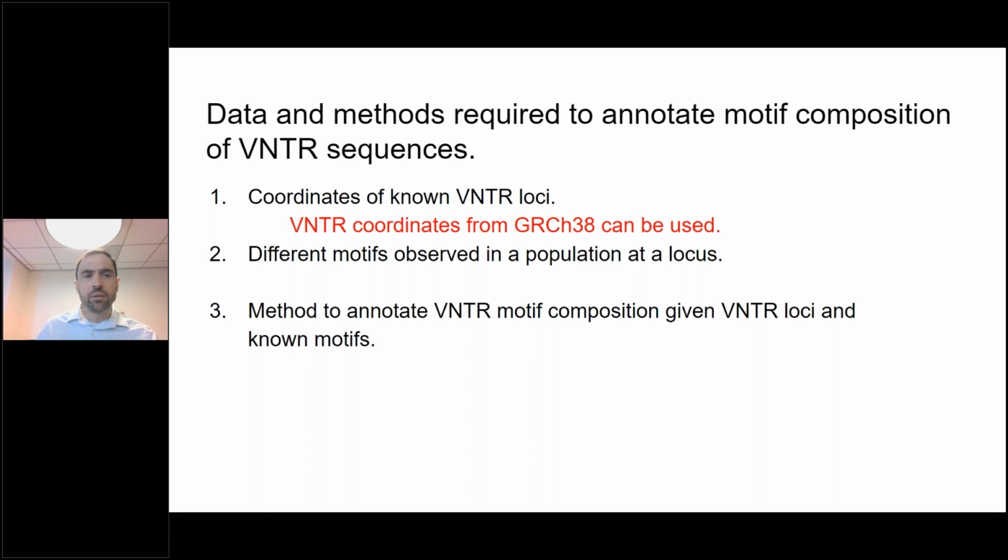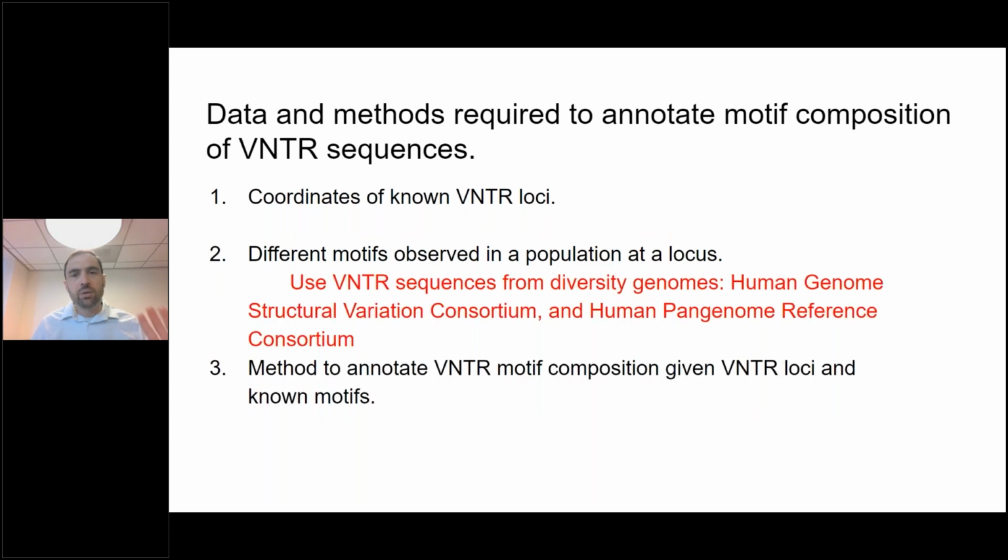So the tandem repeat coordinates, we can just grab those from HG38. There's a bit of a difference. Buyer beware, if you just download from the Santa Cruz browser, there are a lot of Alu sequences that are contained within the normal tandem repeat. You can choose to filter those out if you want.